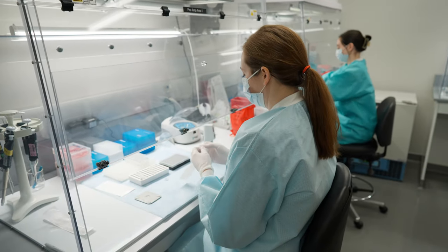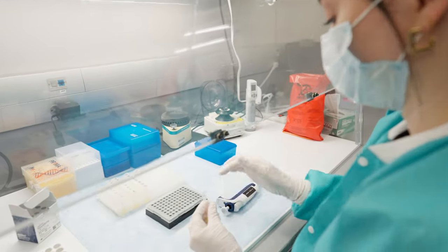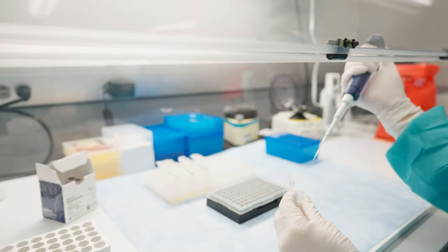Some samples contain large amounts of DNA, while others contain only a few cells and may not have enough DNA to get a usable result.